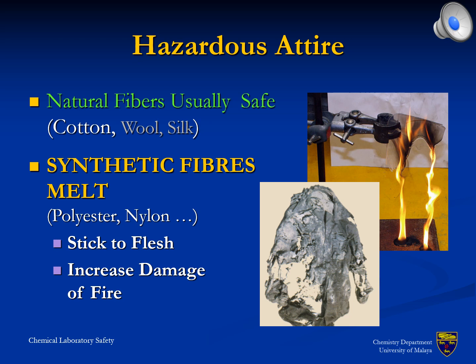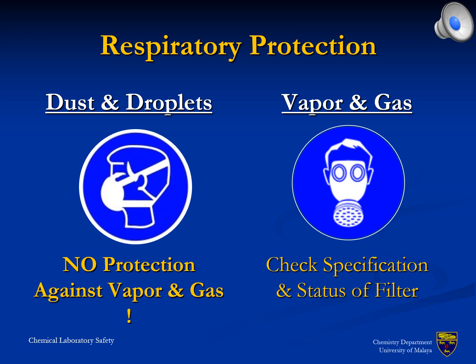Therefore, synthetic clothes should be avoided inside a chemical laboratory. Particularly the use of head covers and scarves based on synthetic fabrics is discouraged. A common misperception applies for protection masks. The use of surgical masks as protection against chemicals only applies for dust and droplets. While such masks may be useful for operation with fine powders and possibly nanomaterial, they do not provide any protection against toxic vapors or gas. A non-suitable mask effectively increases danger rather than reducing it, because it suggests a non-existing protection, which reduces the level of alertness.